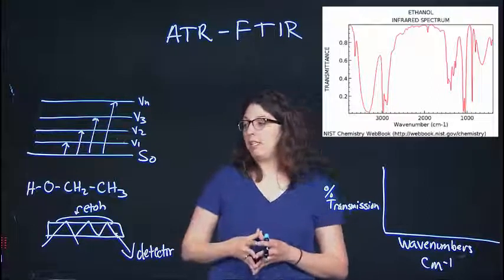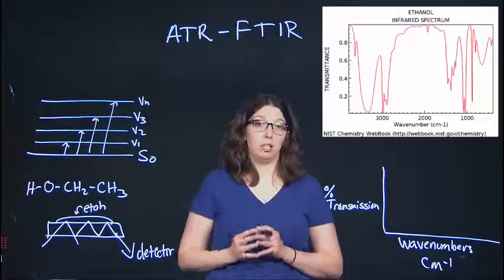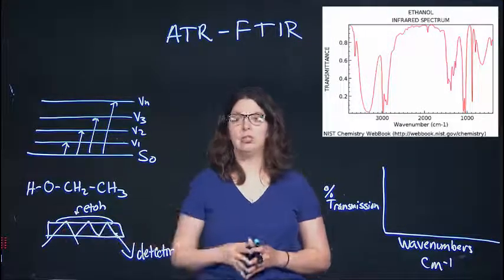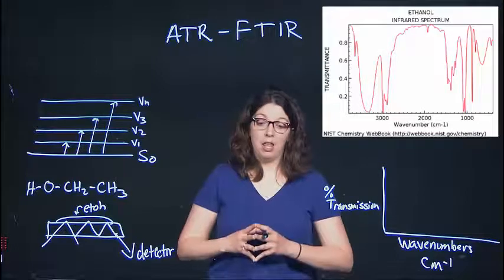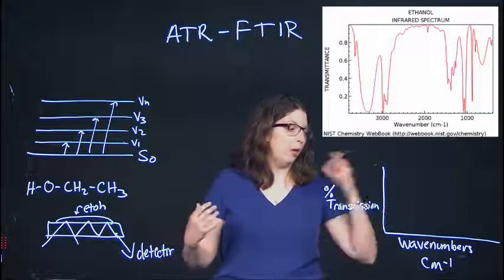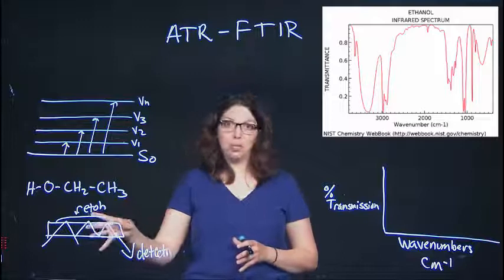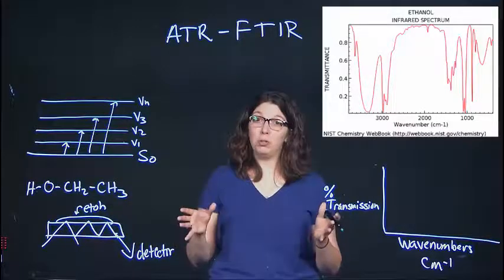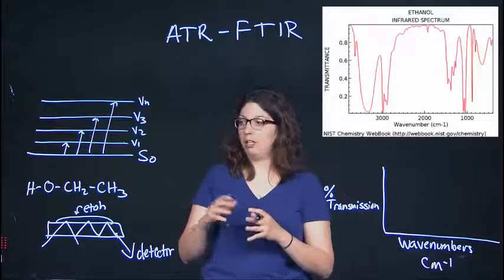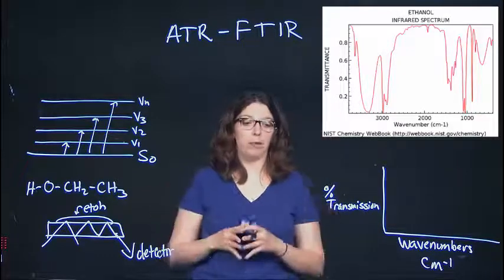The nice thing about ATR as opposed to transmission IR is that it has really, really short path lengths. Like really short path lengths, okay? The depth of penetration into the water or the aqueous solution is so small that we can use aqueous solutions because the water isn't overcoming the rest of the important part of the spectrum. Okay? So that's what's really cool about ATR FTIR. The other thing that's really cool is that it's super easy to use. Right? Your TA will explain the instrument to you and show you a few things. There's also a guide. Really the hardest part is manipulating the software.